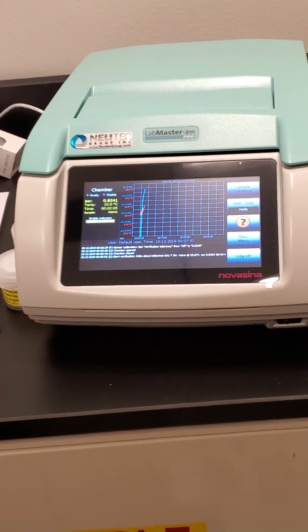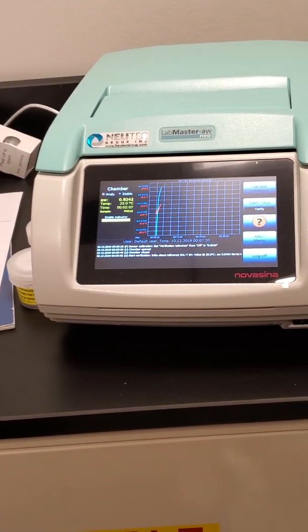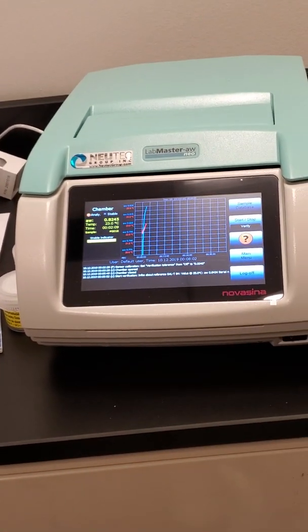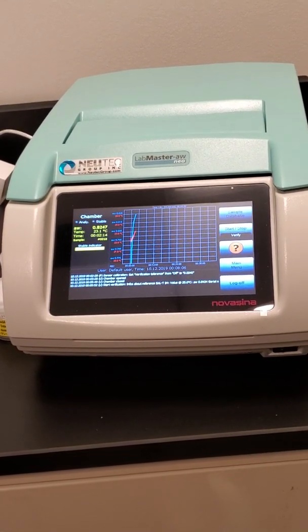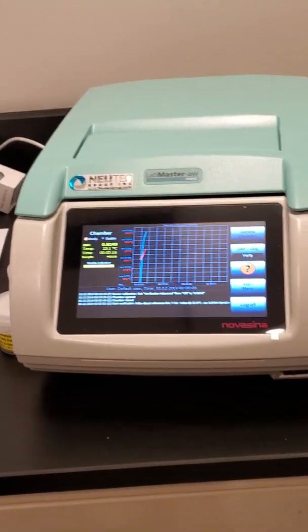So, okay, you've done the calibration. You're ready to run the sample. Okay, so at that point, it's basically the same as the standard, but you have an unknown. You put that in.